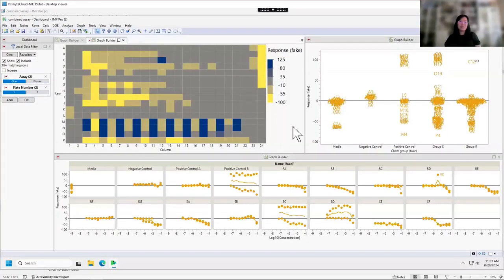Yeah, so one more cool thing that I like to point out, because it's actually hard to find, but ever since I found this, I keep using it. It's in the legend panel, and an example of this is in this heat map.